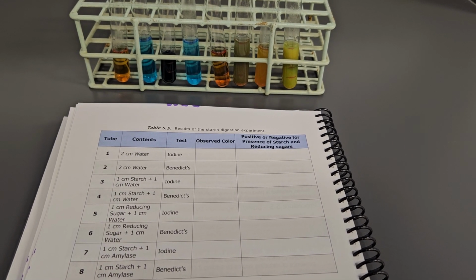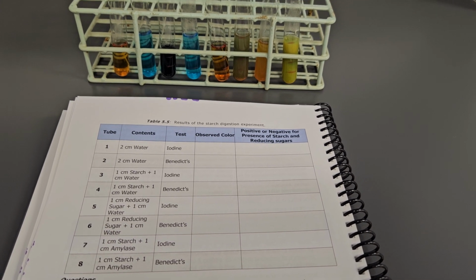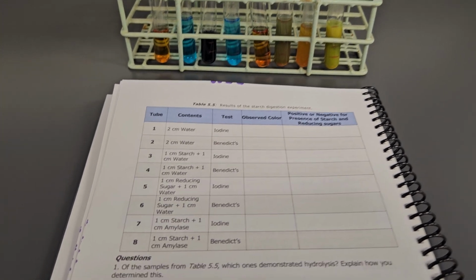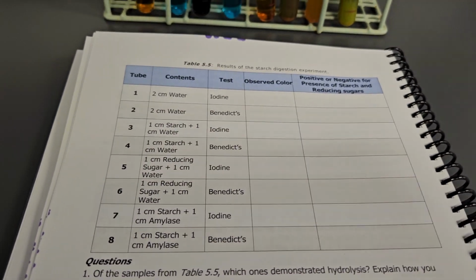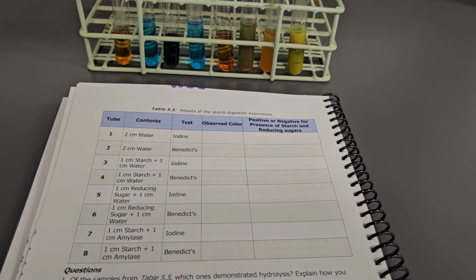So let's talk for a second about procedure 5 from lab 5. With this experiment, we were looking at the activation of amylase. That's the enzyme that breaks down starch into reducing sugars. We had 8 different test tubes that were tested here.